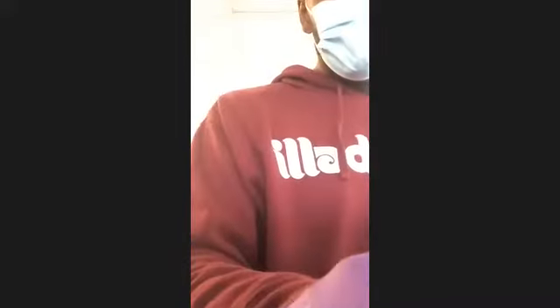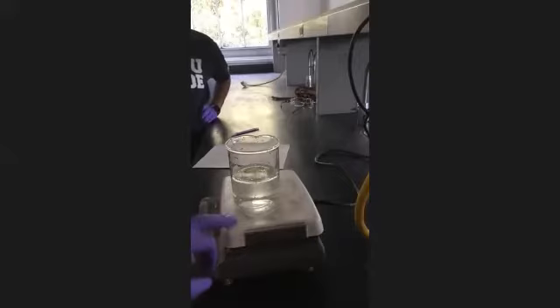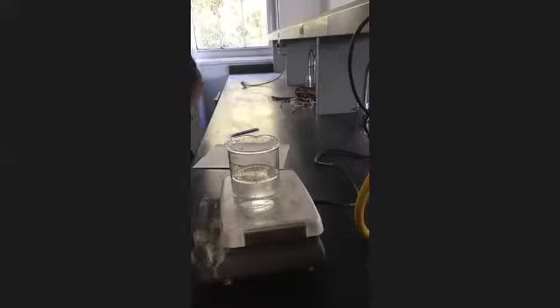So we got a water bath that we're gonna set up. Turn the camera back around. So you can see on the hot plate, excuse me, we have a water bath here. We're gonna turn the hot plate on and start that water to boiling. So go ahead and turn your hot plates on and put the water bath on there, because while the water is heating up, you can be weighing out your stuff. One thing about lab is you want to be as efficient as possible. Everybody always asks, you really gotta stay at 5 o'clock?